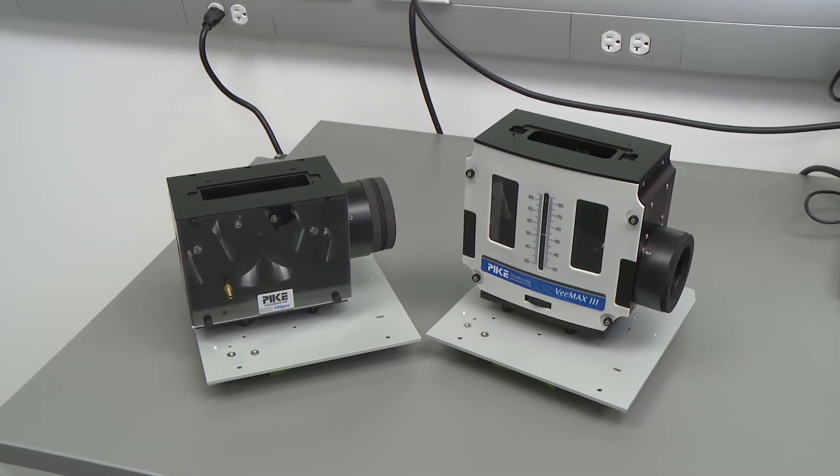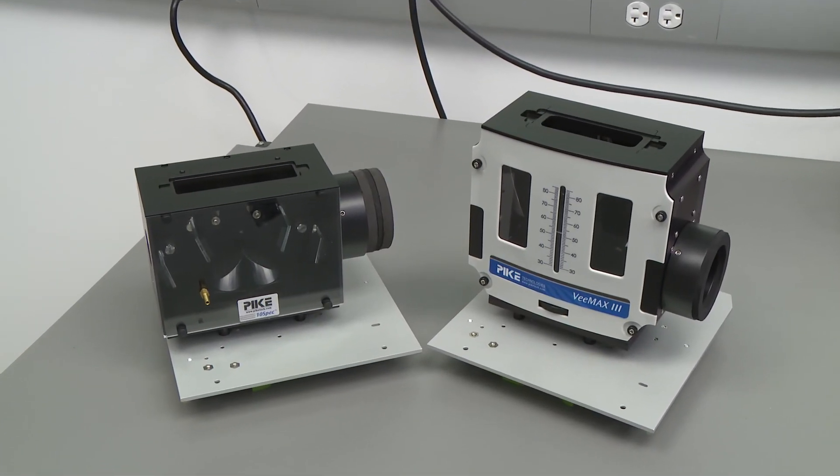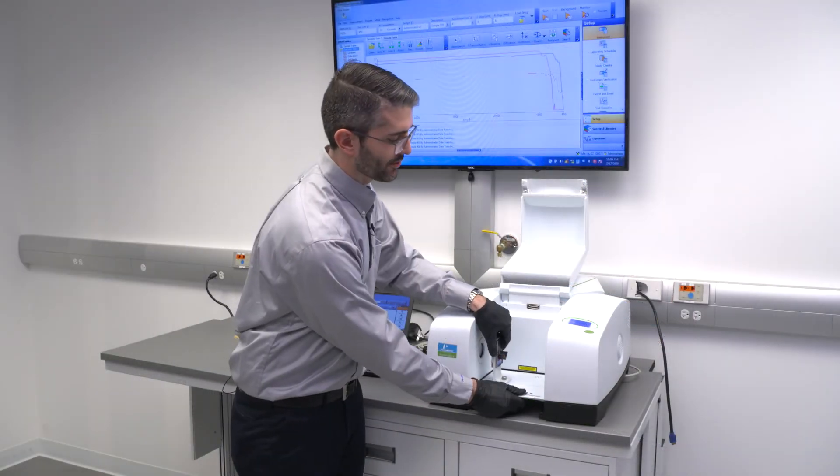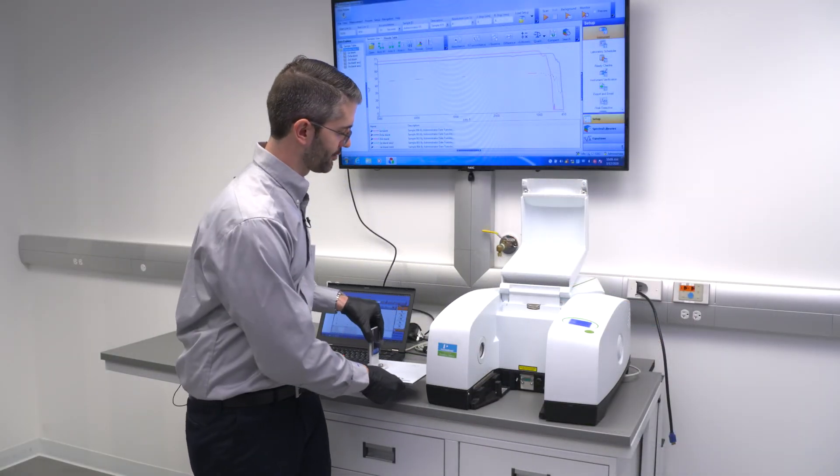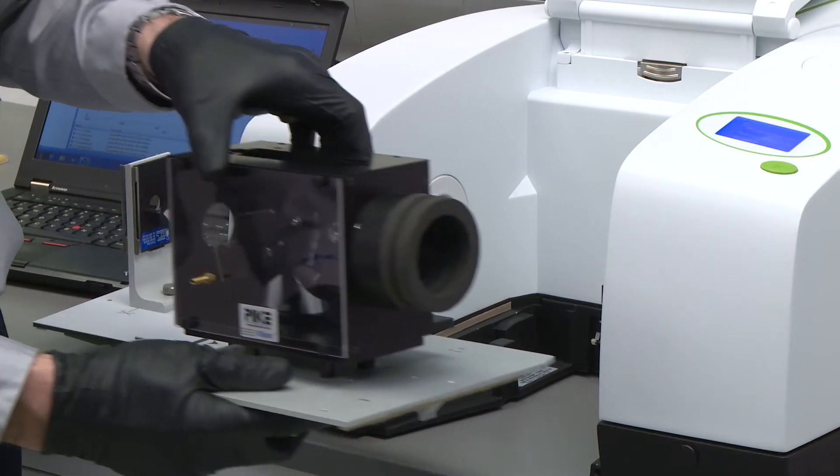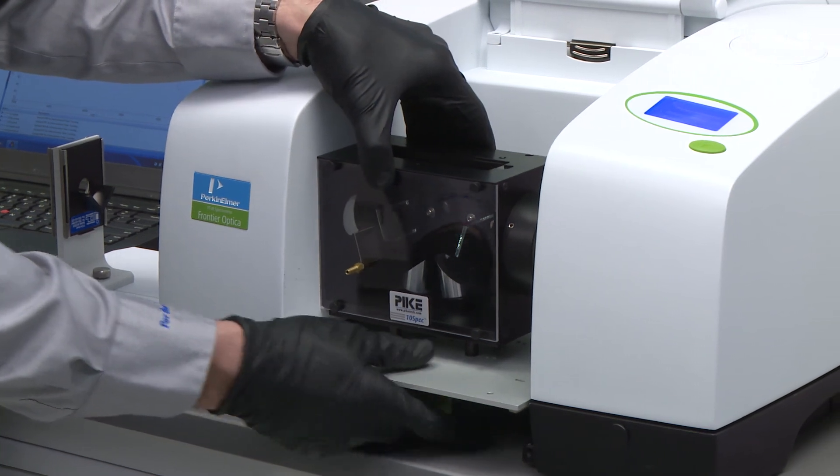As with Perkin-Elmer's other FTIR technologies, sampling accessories are interchangeable in the Frontier Optica. Replacement of sampling accessories is quick and easy. This allows users to tailor the instrument to a variety of experimental requirements.